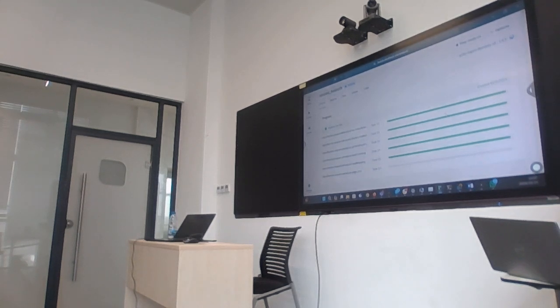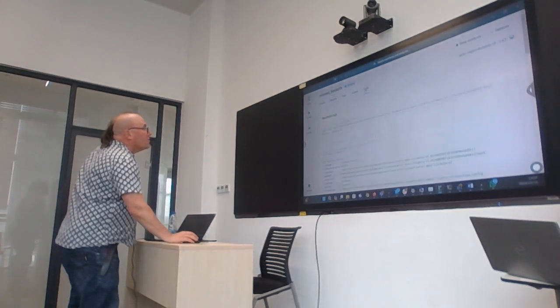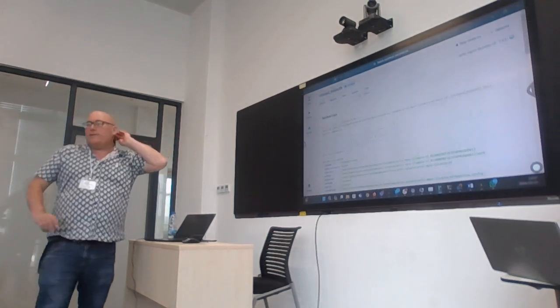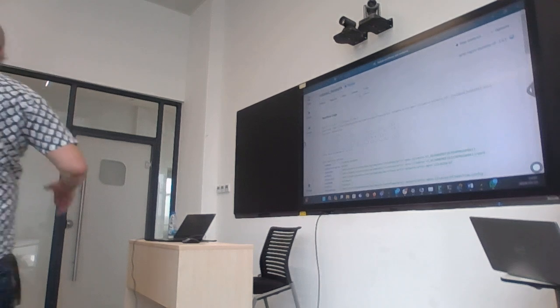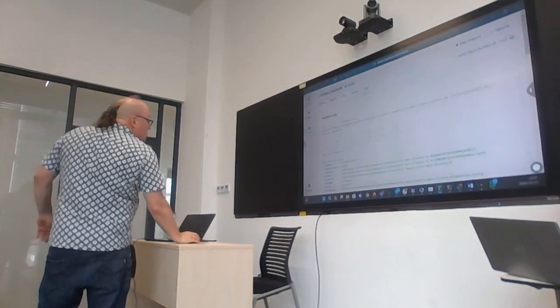Stop with error. That's interesting. Where has it gone? Logs. If you look at the logs tab, you actually see the detailed log file of everything that's happening. Go switch to your logs tab.